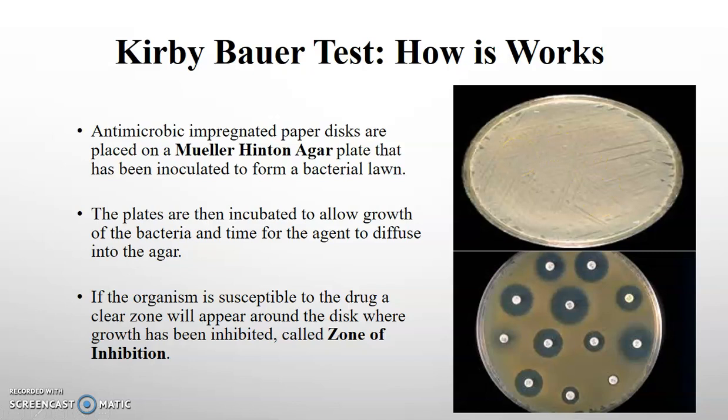When we look at it later on, we might see this big clear area and we might think, oh, that antibiotic works so good at killing that bacteria. But what we're not realizing is, oh, we just didn't actually put bacteria in that spot. So in a medical setting, you could end up giving someone an antibiotic thinking it's going to work when really the test was kind of false. It wouldn't work in that case.